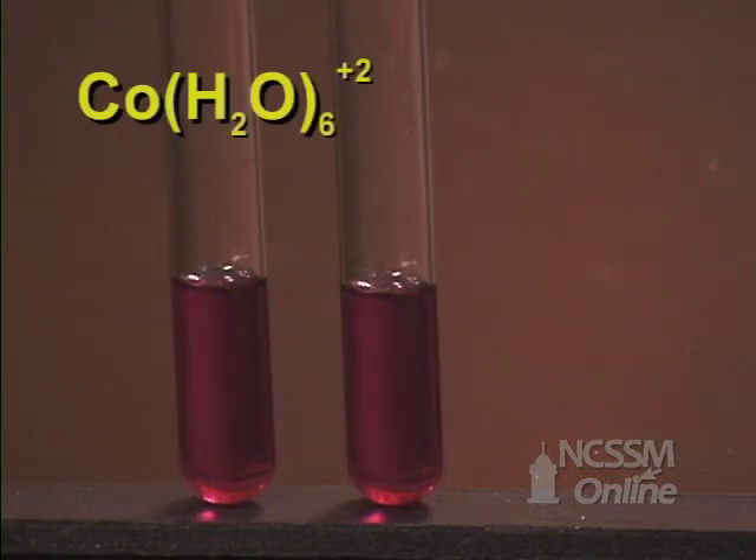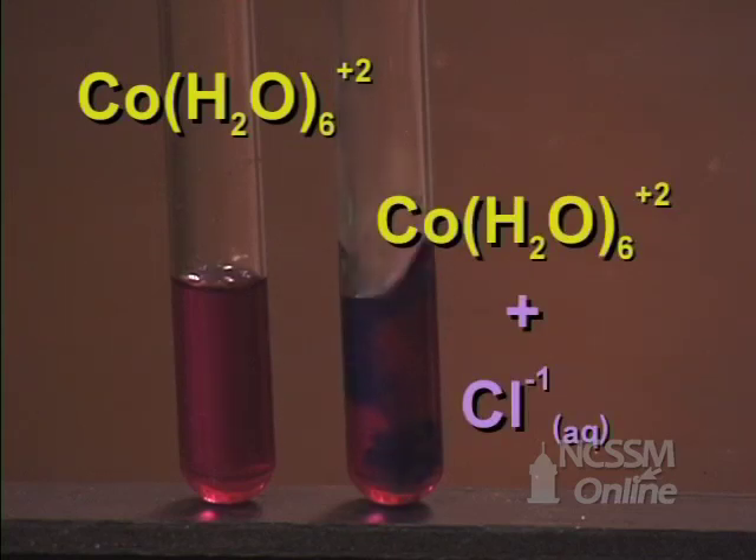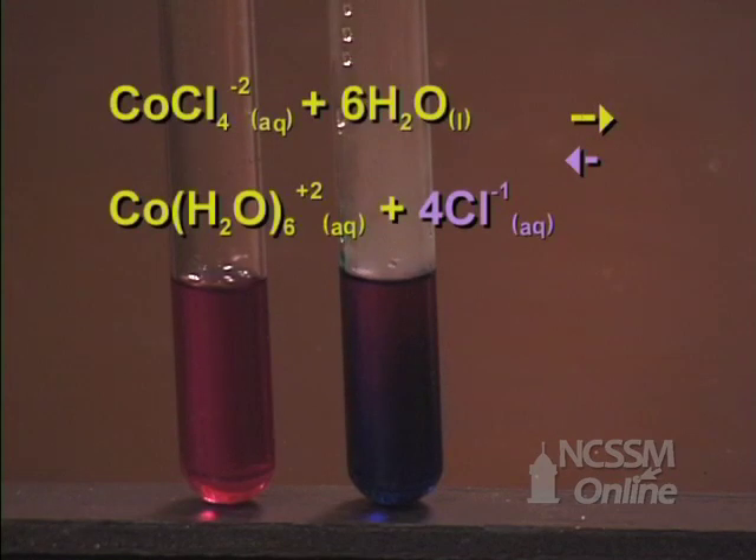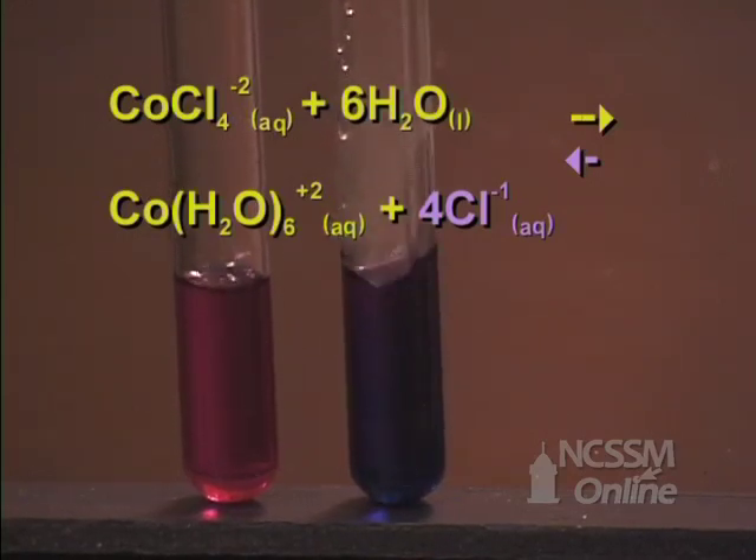We will start with two test tubes with the cobalt water complex ion. We add 12 molar hydrochloric acid to one of the tubes. We notice that the solution turns blue. This indicates that the equilibrium has shifted in the reverse direction. The hydrochloric acid provides a source of chloride ion. As we increase the concentration of the product, the equilibrium shifts in the reverse direction to use up the added chloride ion.